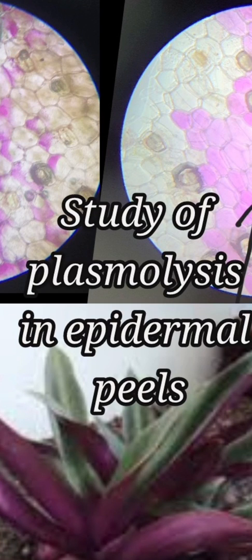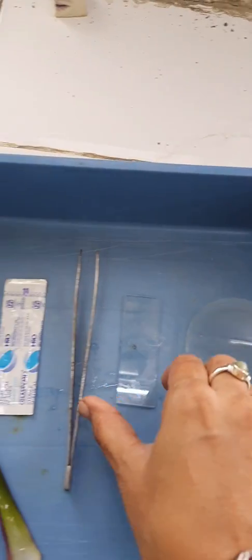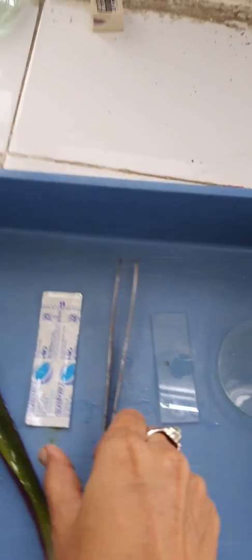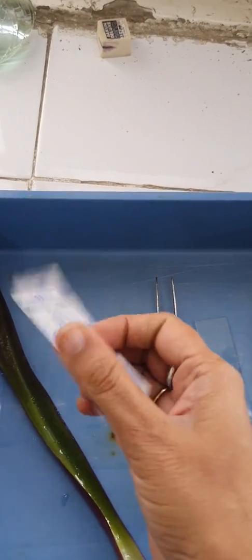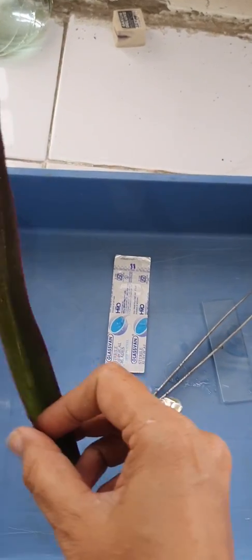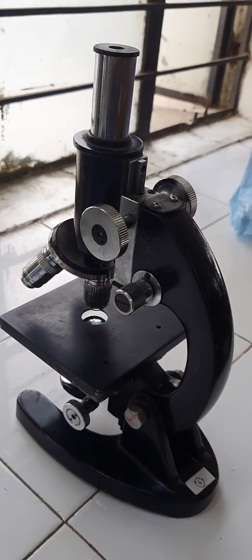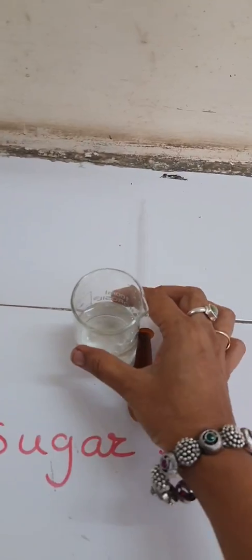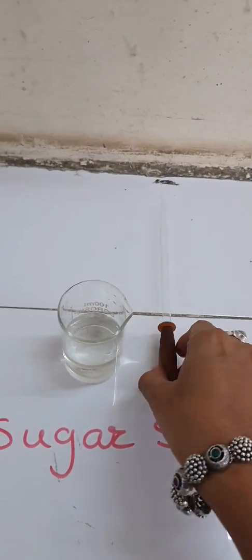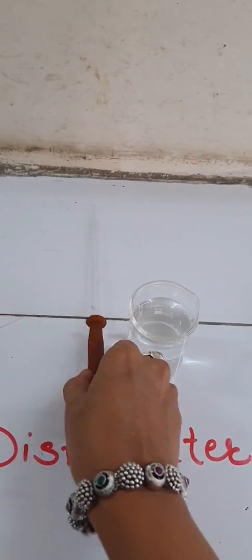Hello students, we are going to start the experiment study of plasmolysis in epidermal peels, for which we require a watch glass, slide and cover sleeve, forceps, blade, fresh leaf of Tradescantia, compound microscope, concentrated sugar solution which is called hypertonic solution, distilled water which is called hypotonic solution, and a dropper.